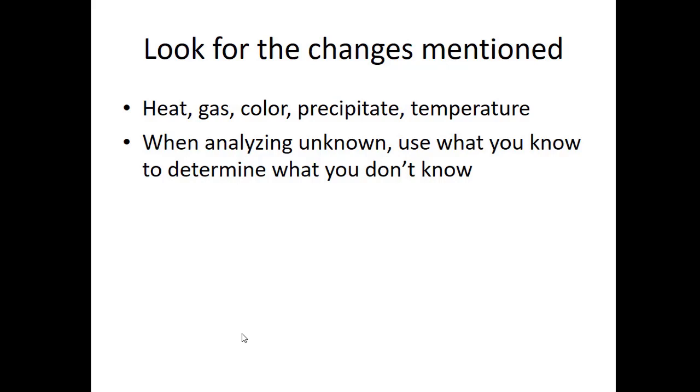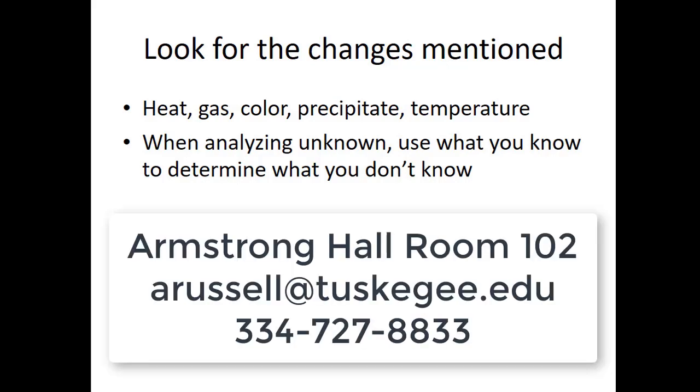And when you analyze the unknown, what you want to do is use what you know about the known compounds to determine what you don't know about the unknown.